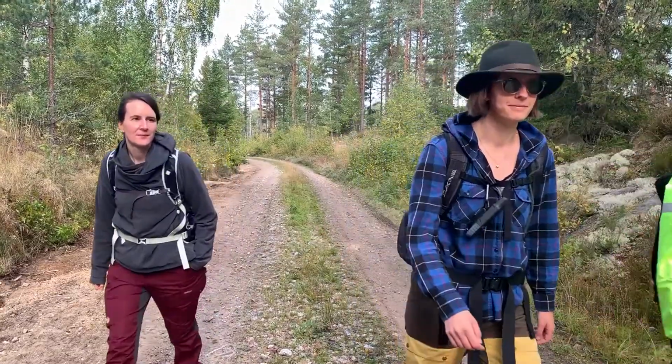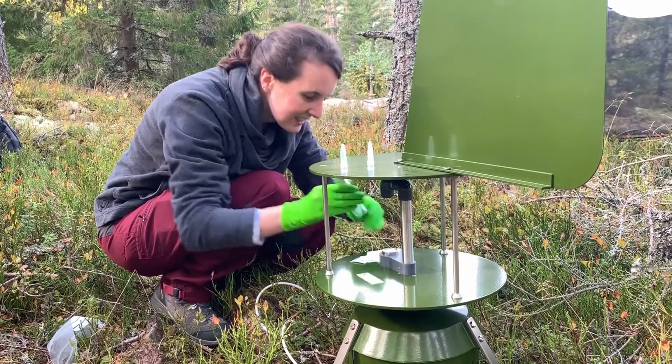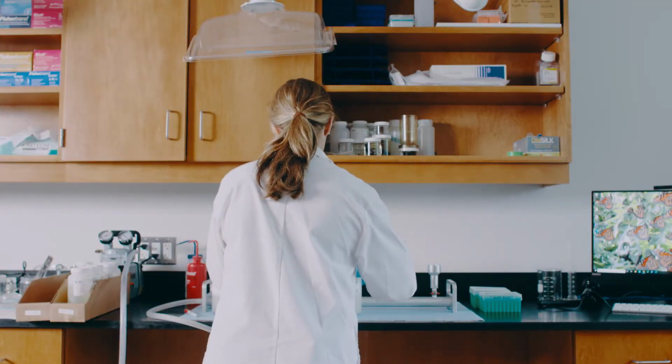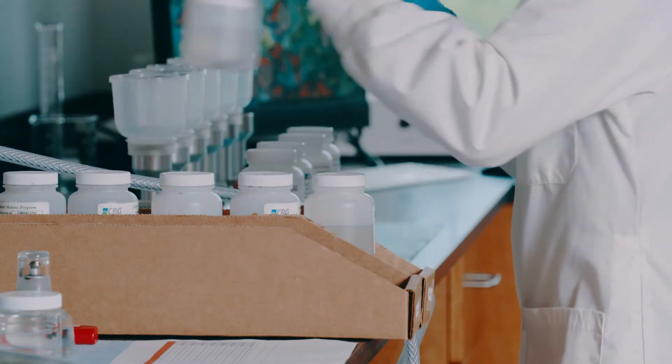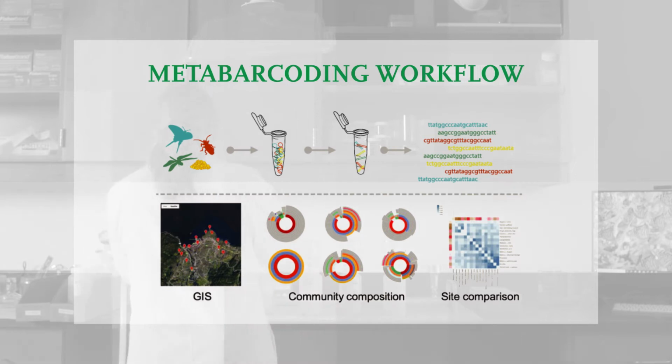This process begins in the field by collecting small organisms or even just samples of water, soil, or aquatic sediments. Back in the lab, the samples are processed in bulk without sorting them first. Different labs might use different metabarcoding protocols than shown here, but the steps are largely the same: DNA extraction, amplification of the barcode region, and sequencing of this region. The steps are similar to the DNA barcoding workflow, but the technology used is different.